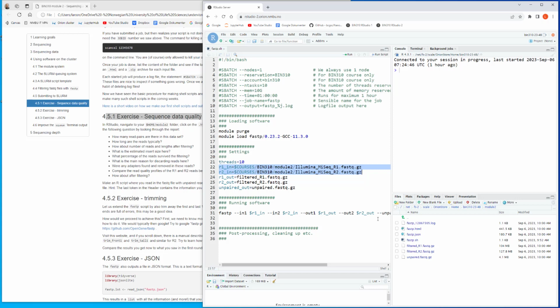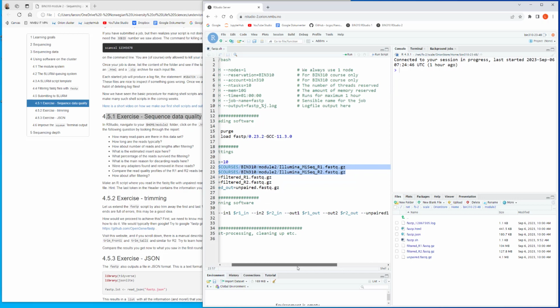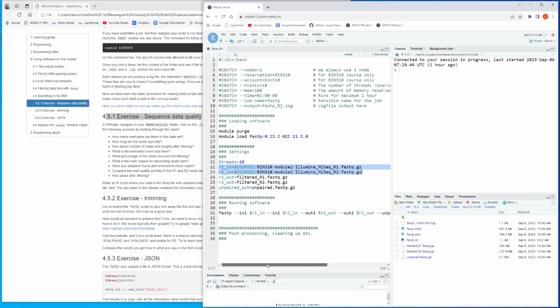removing bad sequence or poor sequence. And this is poor based on the quality scores in the FASTQ files, right? It's not really checking if the read is correct or not. How could it, right? But it relies 100% on this quality score. So if the sequencing machine says that this is a bad score or a little bit doubtful about the quality, it will remove it. So that's why we have three output files.